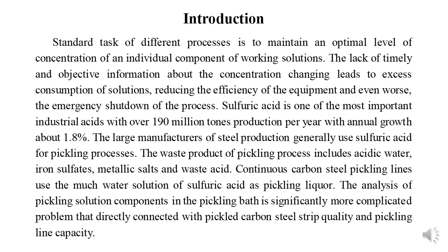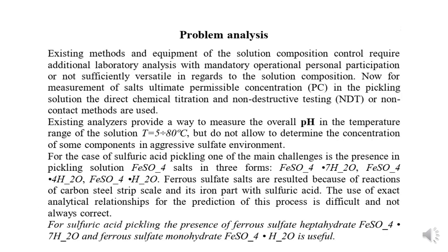The analysis of pickling solution components in pickling baths is a significantly more complicated problem, which is directly connected with pickled carbon steel strip quality and pickling line capacity. Existing methods and equipment for solution composition control require additional laboratory analysis with mandatory operational personnel participation, or are not sufficiently versatile with regard to the solution composition.